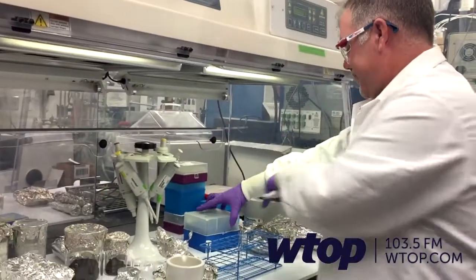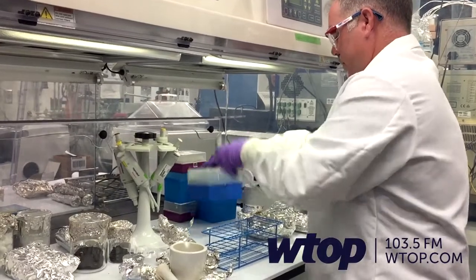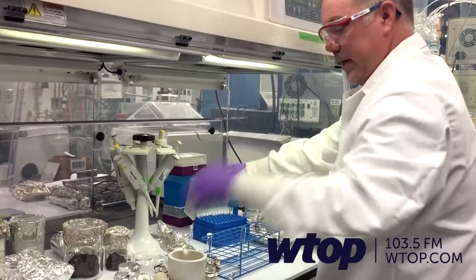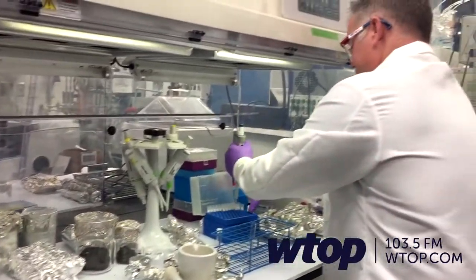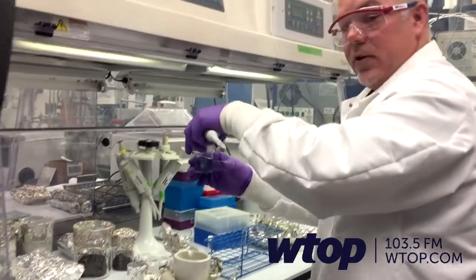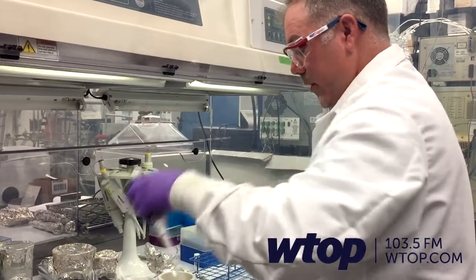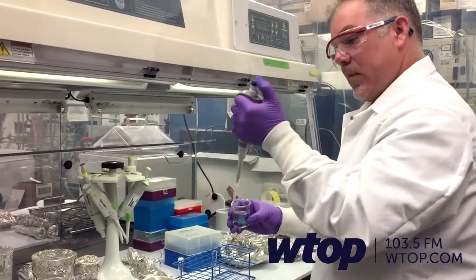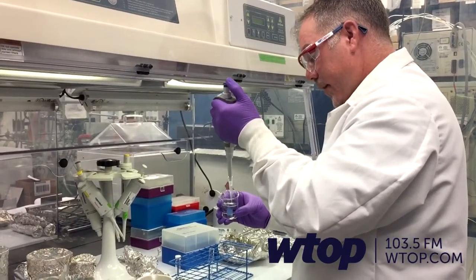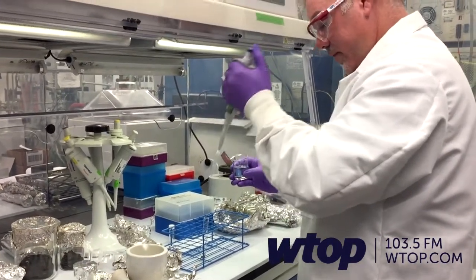We'll use a pipetter for that with clean pipette tips. We have clean distilled water — we don't want to contaminate the meteorite, so we use very clean water. We only need about a milliliter of liquid; you don't need much. We'll just add it directly to the meteorite in the test tube.